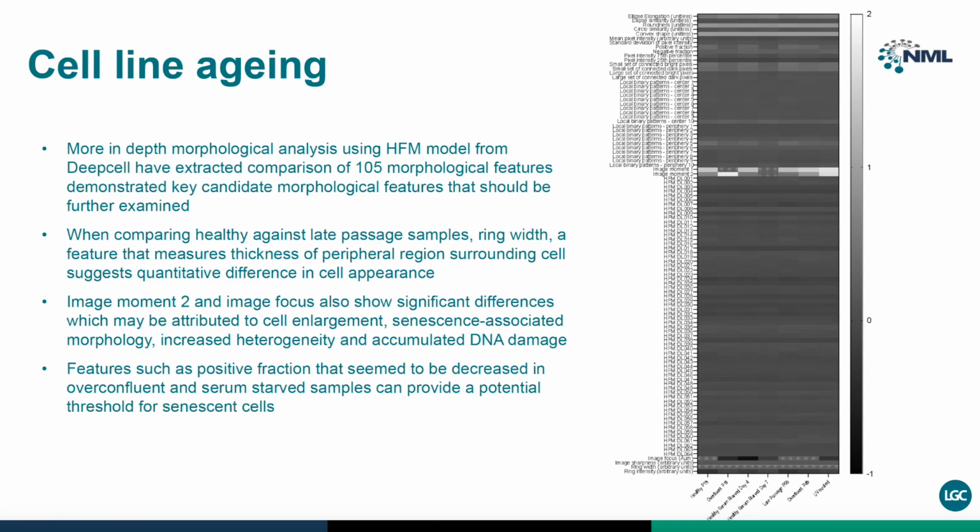So what we wanted to show you here is that we were able to start identifying these significant differences within these morphological features that would otherwise be missed in traditional gating strategies and simple morphological profiling.